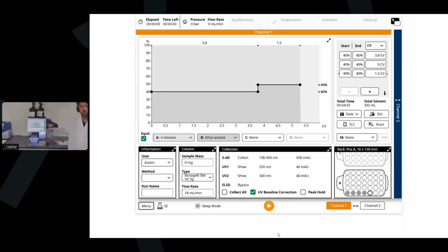So I'm going to move over to the software portion so I can walk you through. Let me blow that up so you can see this a little bit more, and I'll walk you through our user interface. We'll start down here on the bottom left-hand side with our information. Under this information tab, it tracks your user logins, or users that you have on the system. One way to improve reproducibility is to be able to find your work.